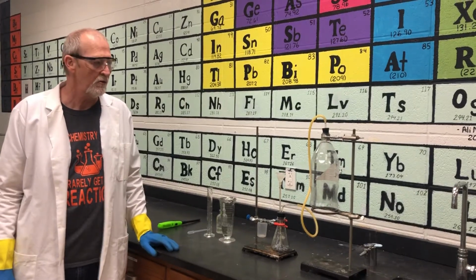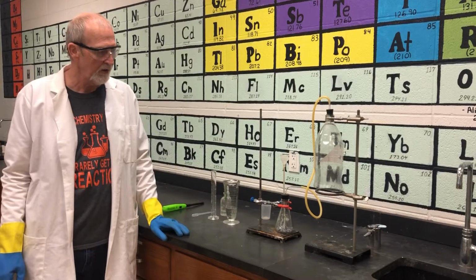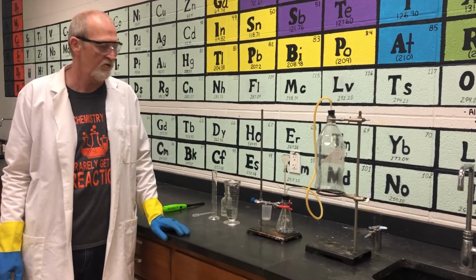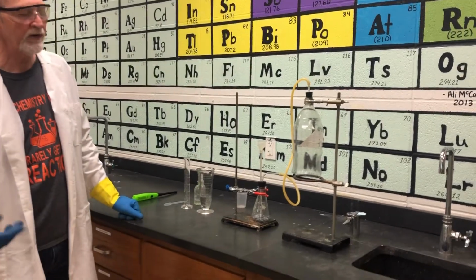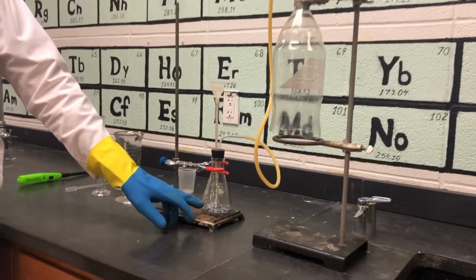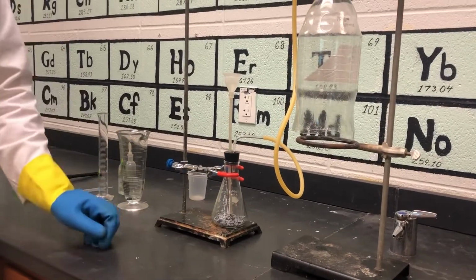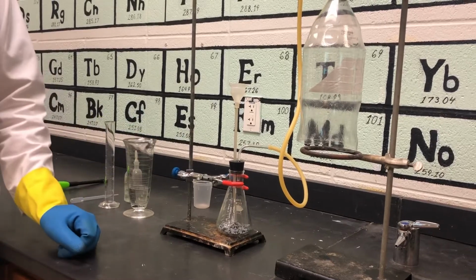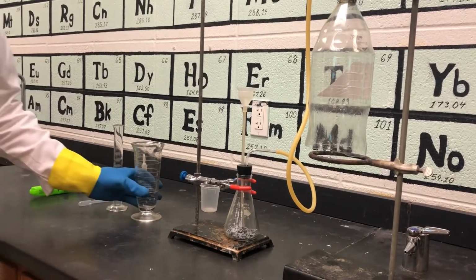Good day, students. We're doing kind of a finale today in our demonstrations. This one is called the Explosiveness of Hydrogen, and just to show you some of the simple things that are involved with it, we're using an excess amount of zinc, which is in this 250 milliliter flask. I've got a clamp just for security. I thought it was kind of cool. I had some of these antiques here.